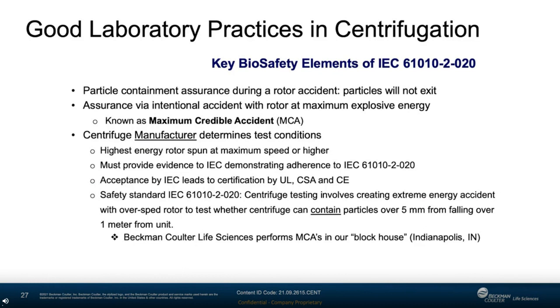And I might add that in this case, the manufacturer must take its most explosive potential rotor and literally damage it so that it comes apart during an overspeed run to be able to test the ability of that centrifuge to contain that explosion.